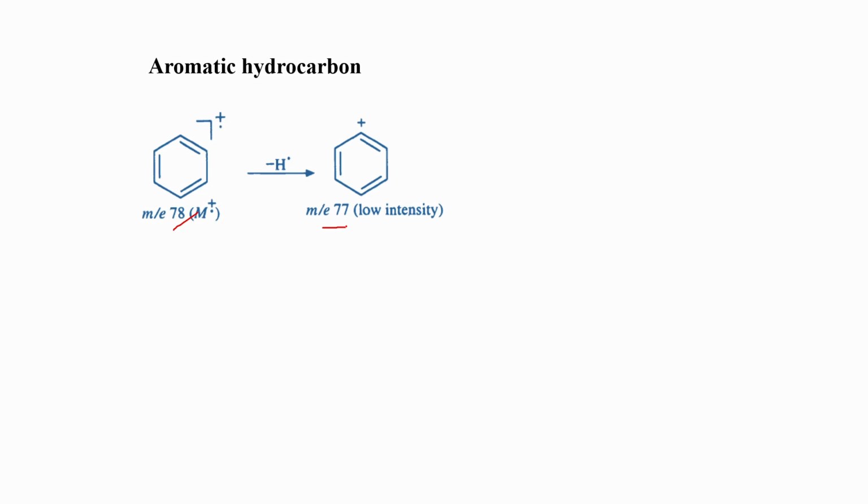Phenyl carbocation is very less stable, and hence its peak is with a very low intensity. It eliminates a neutral molecule, acetylene, forming this carbocation, that is cyclobutadienyl carbocation with m/z value 51. That is one of the important fragmentations of benzene.